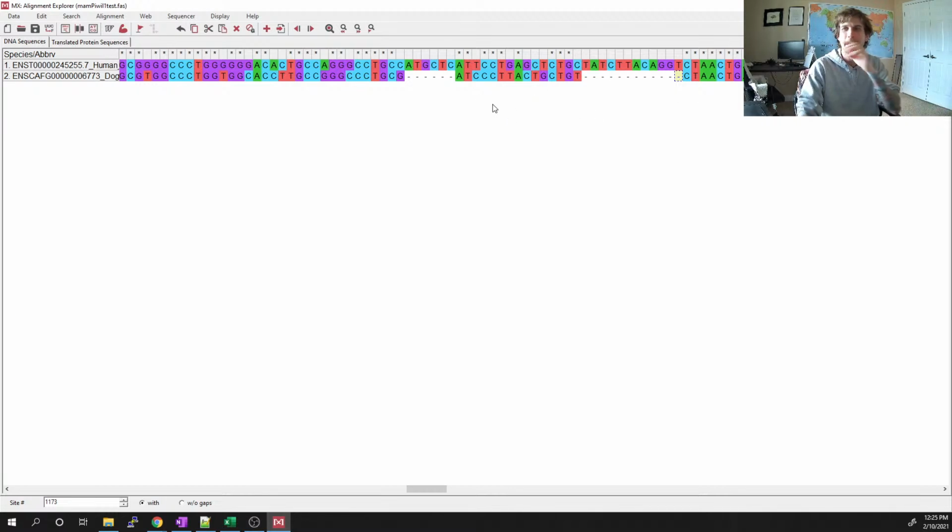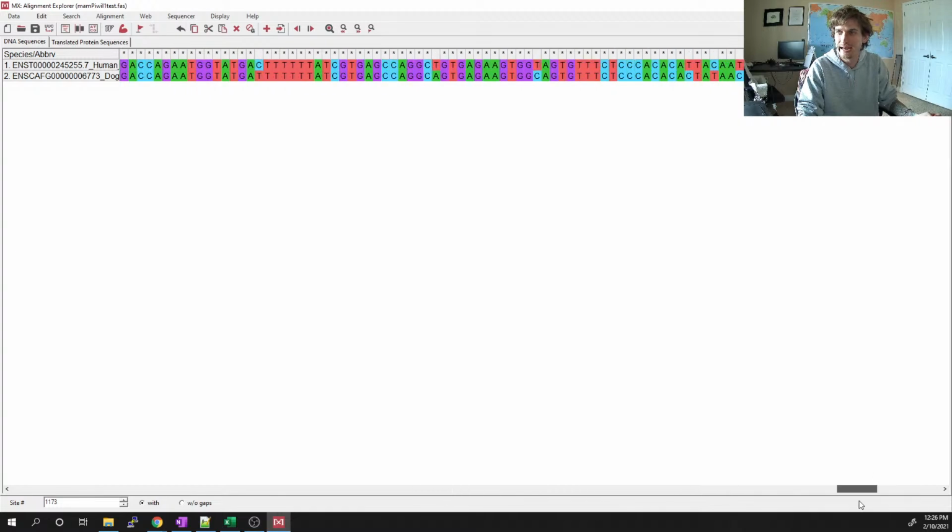Now, if we take note, these gaps are in multiples of 3 for codon length, right? And even over here, these gaps will be a multiple of 3: 3, 6, 9, and 12 to reflect 4 codons. Okay, and then everything looks nice, and our stops are in the right place. Yay. Our sequence is pretty much the same throughout, except for this slight gapped region.